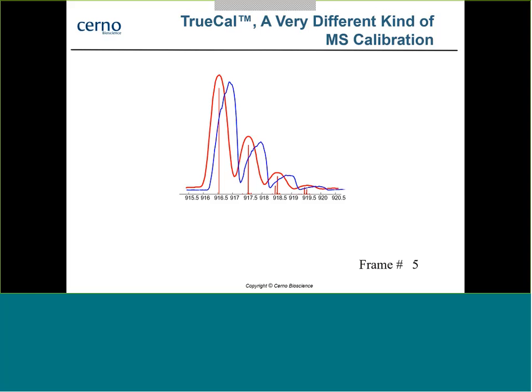The advantage of this is that, as you can see, if we compare it to the original measured mass spectrum, it's well calibrated in not only the mass, but also in the profile shape itself. This is going to enable us to not only do accurate formula identification using the isotope profiles, but also to do mixture deconvolution.